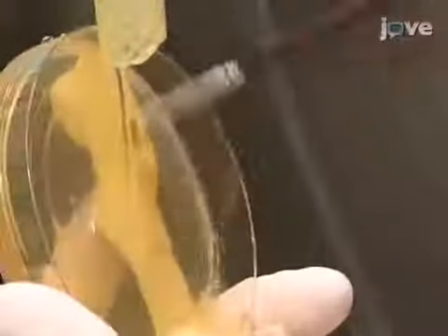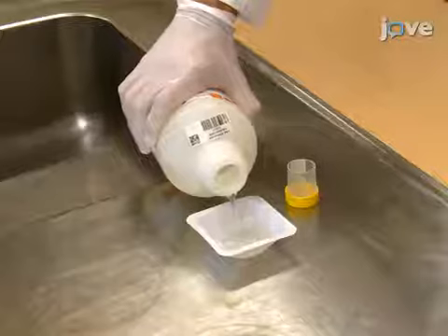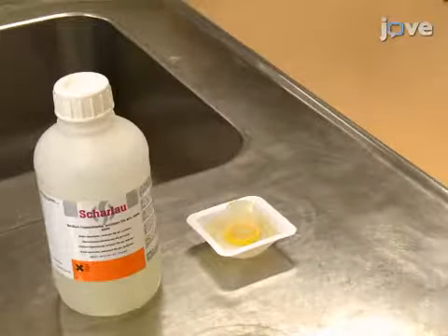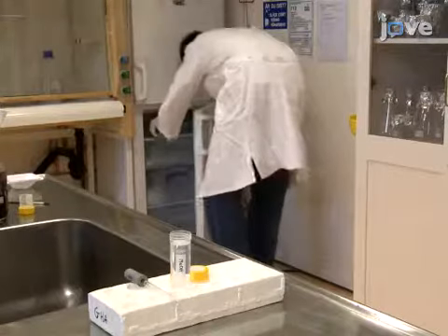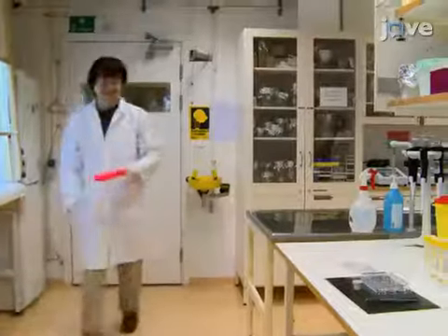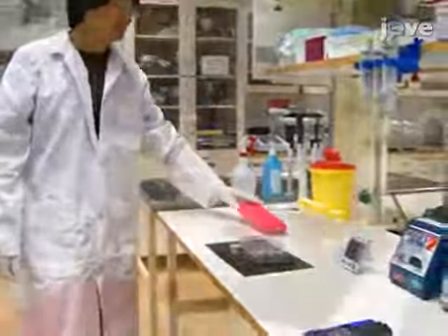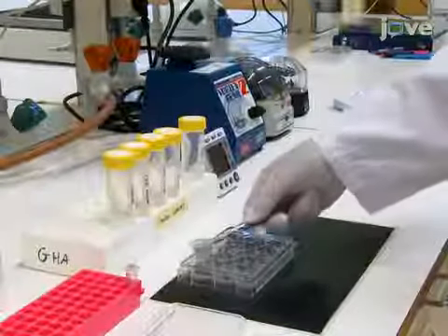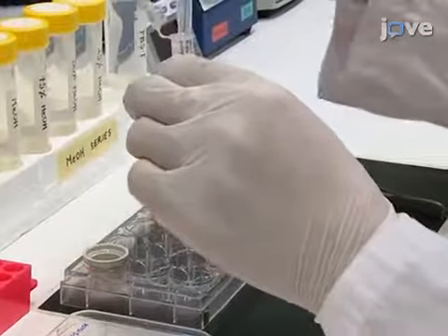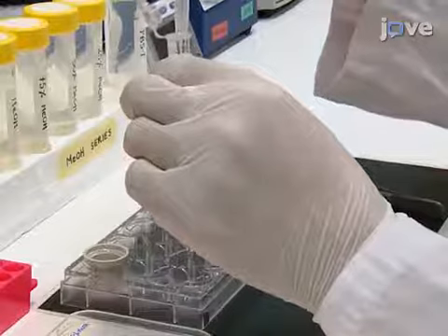Using standard procedures, collect, dechorionate, fix, and devitellinize the required embryos, then store them in methanol in the freezer until needed. Begin with the embryos at room temperature, fit an insert into the first well of a 12-well plate, and add 2 milliliters of methanol. Transfer the desired amount of embryos into the insert, which is used to carry the embryos throughout the procedure.